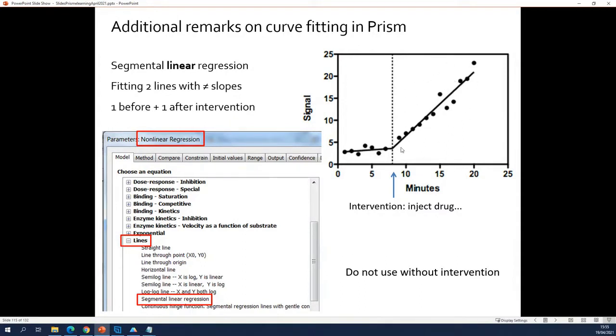So something that looks like this. If this is what you do, if you do an intervention like you give them a drug or you make them sick at some point, then there is something called Segmental Linear Regression.